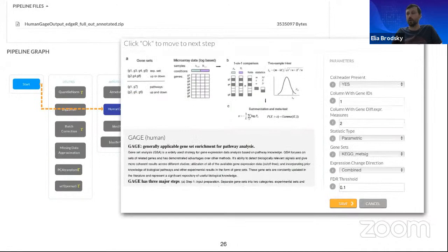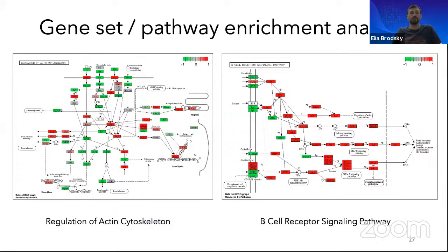We'll talk about some of the methods and settings for this analysis, what the outputs are, how to interpret these outputs, and what we can learn about the biological processes and differences in different data sets that explain this type of variation.